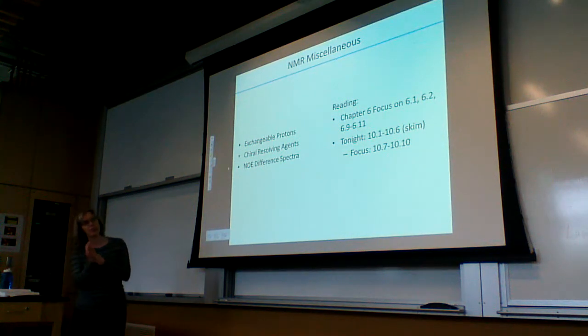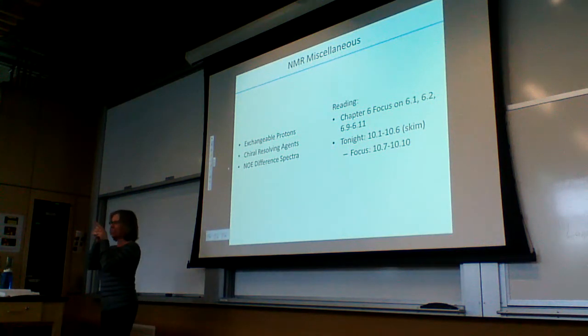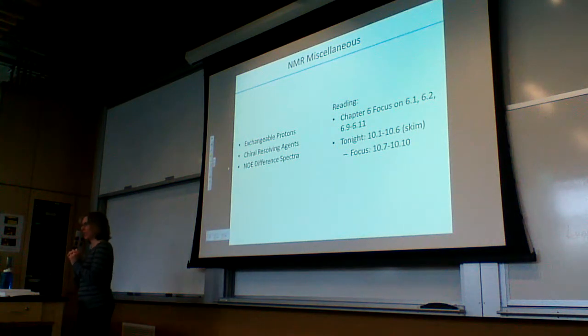And I'm actually running the samples myself, and so you'll get to work them up on Delta, so you can actually zoom in on things and look at them. But each and every one of you needs to do the workup on Delta on your own. Don't have one person do it and save it, and then everybody looks at the same one, because I want you to have the experience with that as well. So everybody turn in their own workup.